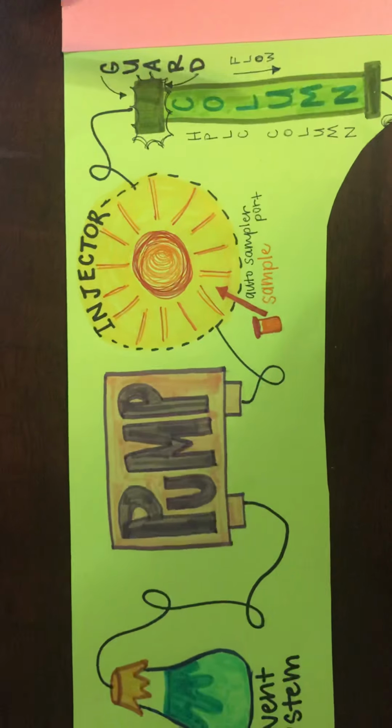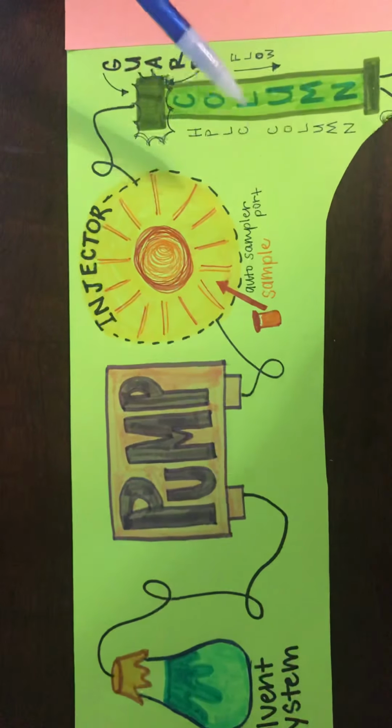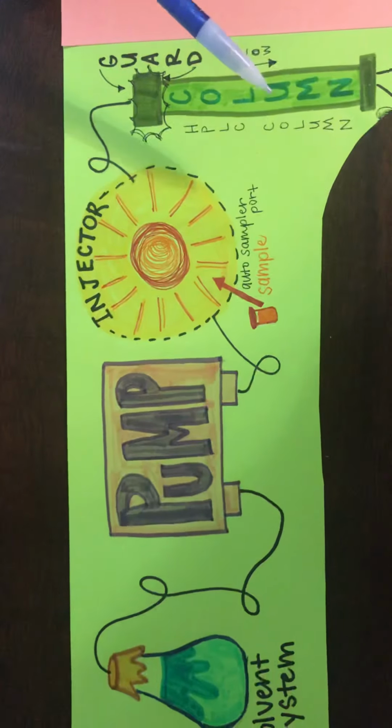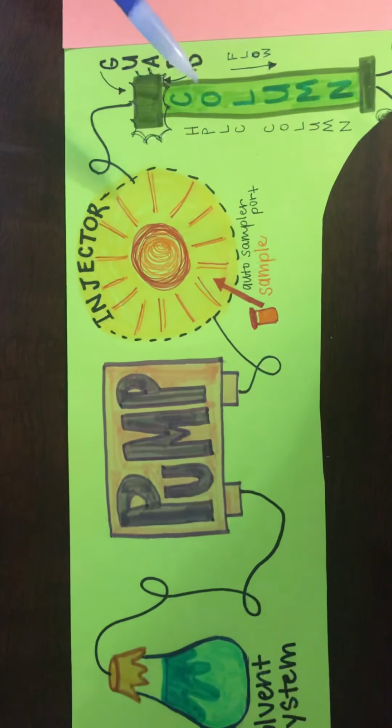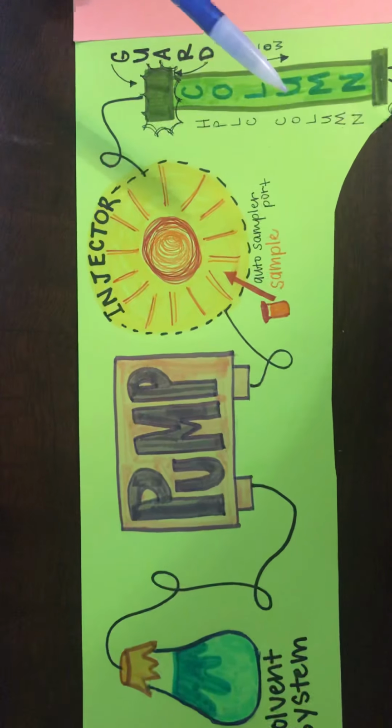The samples stay in their liquid phase throughout the whole entire system, and this allows us to analyze molecules that are much more complex and larger in size than we would with the GC.